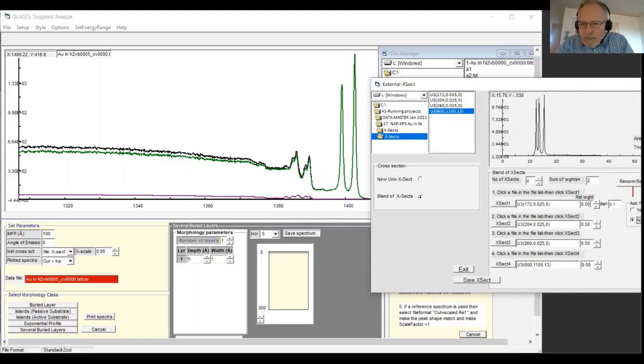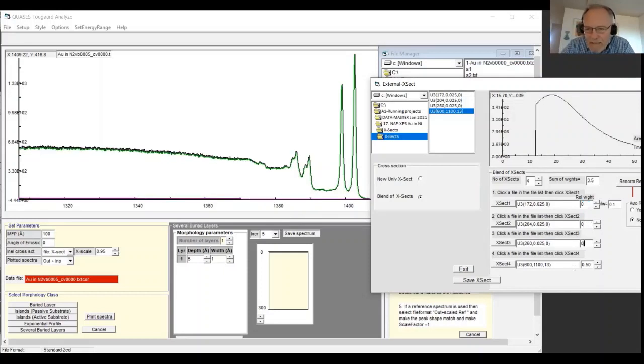So we start by putting in weight 0 for these things, the smaller peaks here, and we have just the continuum of excitations. We'll first find a reasonable value for the depth to get the weight of this one roughly correct.